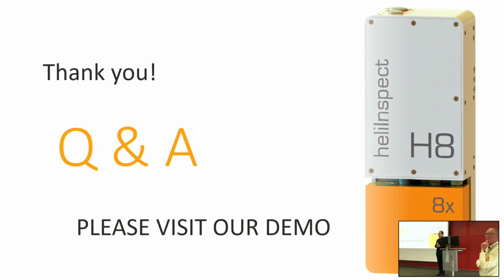Right, that's why I was thinking actually, so the higher magnification lenses also have higher NA. Correct. So they also have steeper capabilities. That's why I was showing you that graph where I measured that artifact with multiple magnifications. And we got 50 times indeed, and you're right, it's not just the lateral resolution. The NA increases by an order of magnitude. So indeed, we can see the features better, but it's not likely that at 2x I'm missing a lot of data. There are a couple of outliers, but that's pretty much it.